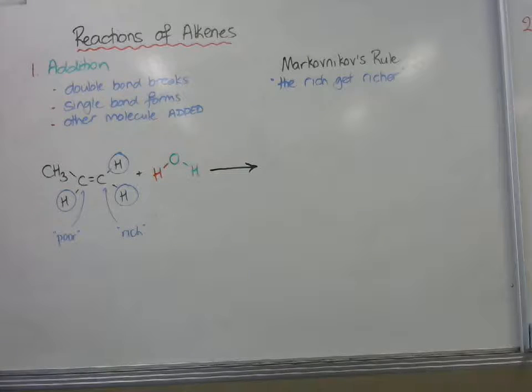Alkanes and alkenes, and how we use these to maybe decide whether an unlabelled bottle was an alkane or an alkene. Found a lot of things in common, like they both were immiscible or insoluble in water and floated. We found that both decolorised bromine water, but in different ways, in different types of reactions. What we're going to look at today are just the reactions of the alkenes.